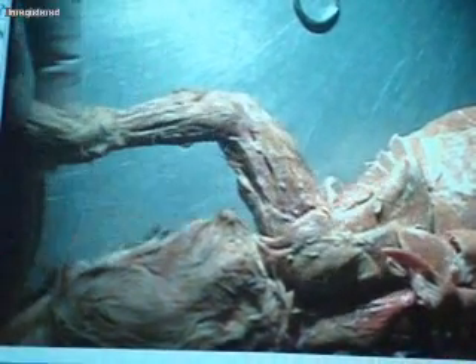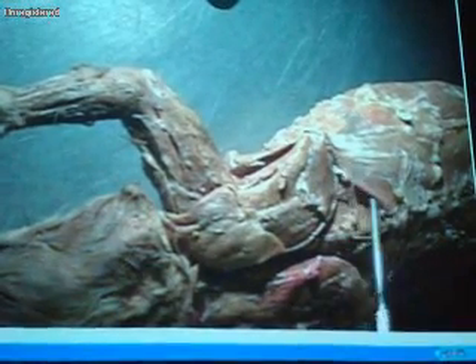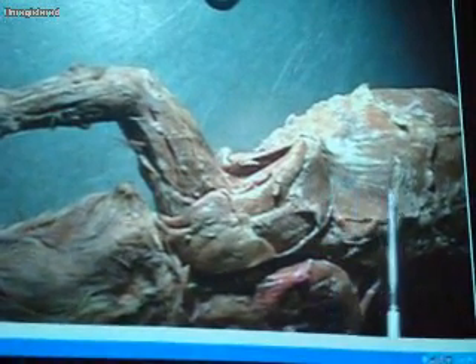Now turning them over, you get to the extensors. Looking at the top of the arm, we have a muscle coming from the front — latissimus dorsi — that starts in the front and wraps around. Right next to that there's a clear separation, and a muscle that goes across the back and covers the lower part of the scapula: spinotrapezius. You can see a little flap of it covering the lower portion of the scapula.